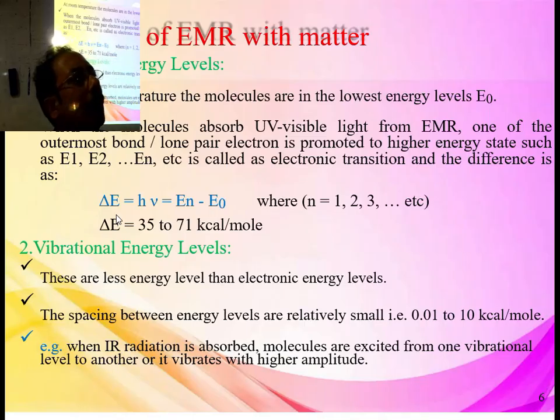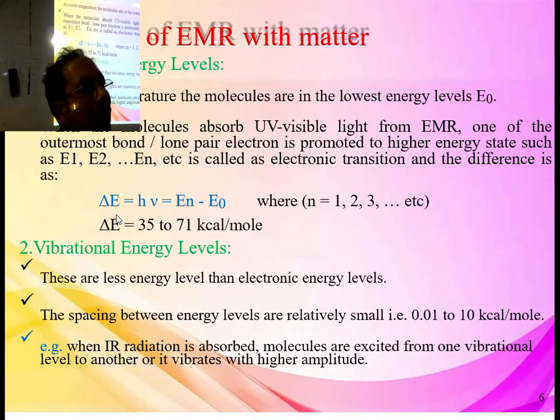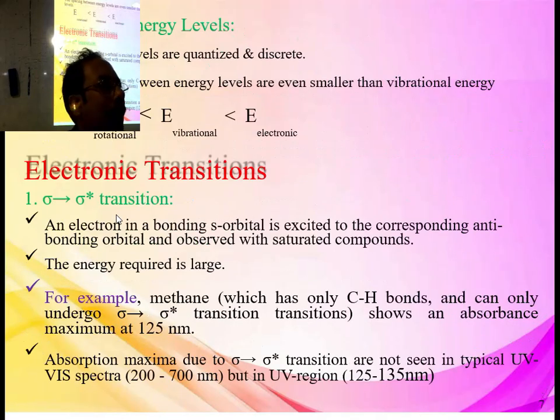Some white particles are floating in the water. For a forensic test, how do you decide whether there is really a drug or not? With the help of spectroscopy, you can decide whether a drug is mixed into that water. This is the practical thing.